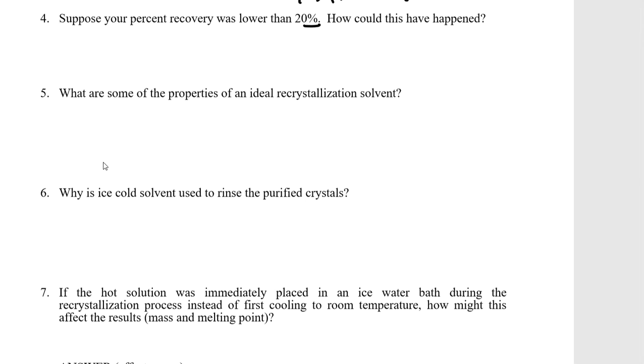Number five and number six can be found in the background information. What are some of the properties of an ideal recrystallization solvent? Why did we use water here? Why didn't we use something else? And is water allowed to be used every single time for everything that we do? Of course, the answer to that is no. So how do I go about choosing a proper solvent to use in the recrystallization technique?